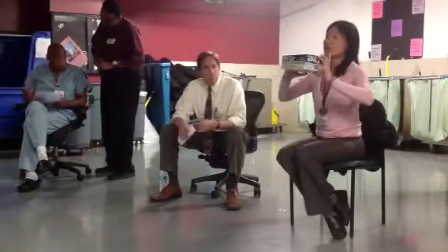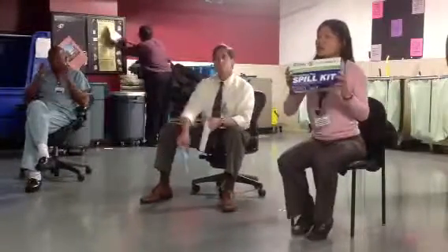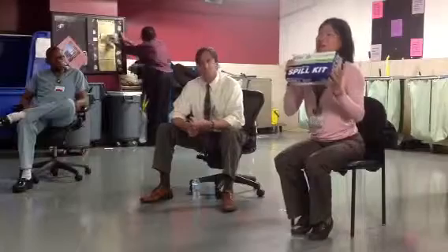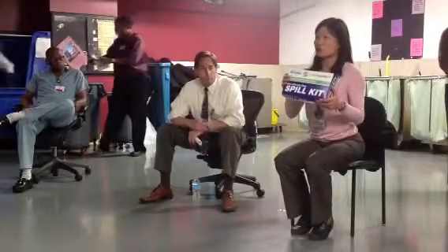So, in order to perform the cleaning, you need to make sure you have one of these spill kits available. I spoke to Yesenia. Yesenia will be able to obtain a few in the office. So you want to make sure where to find them. Talk to Yesenia to see where to find them. But if you don't find it, the other location where you can get them is from Central Issues. You can get them in Central Issues.